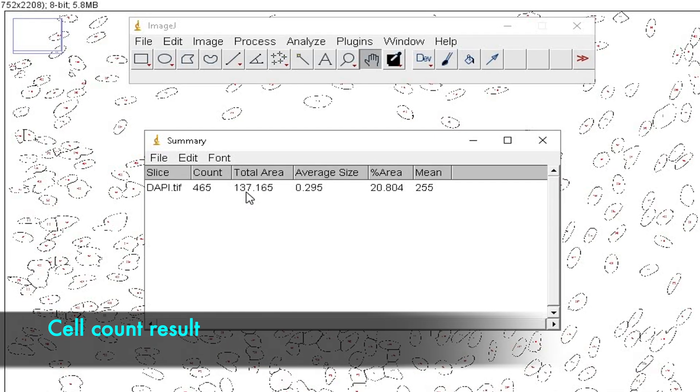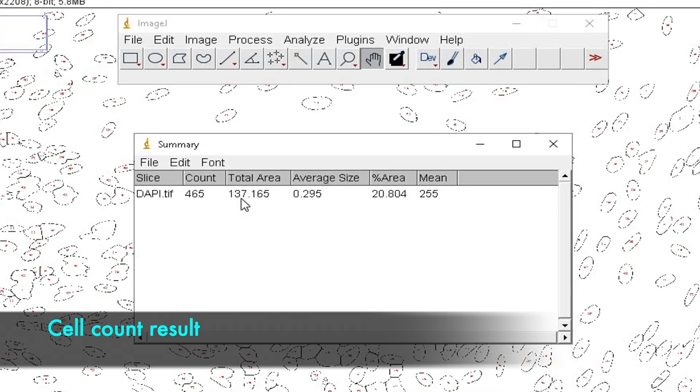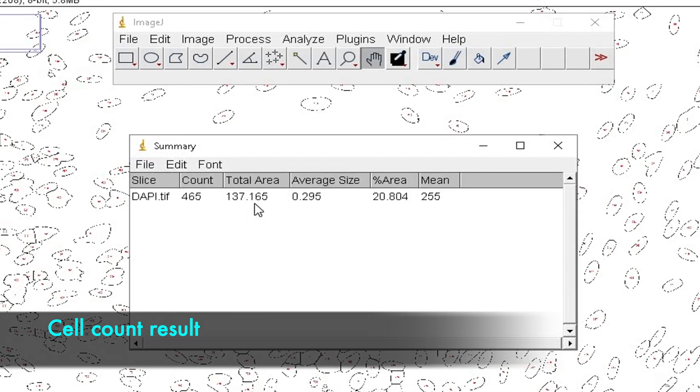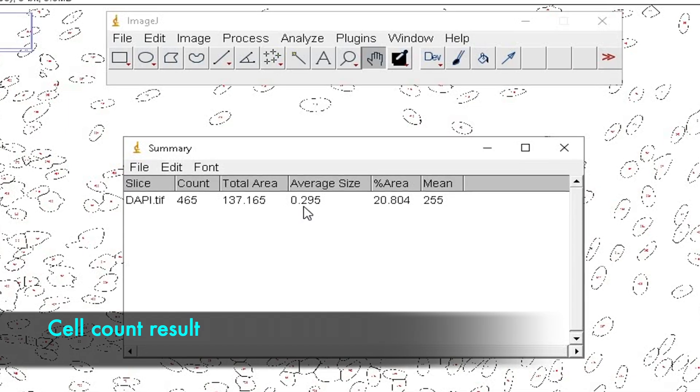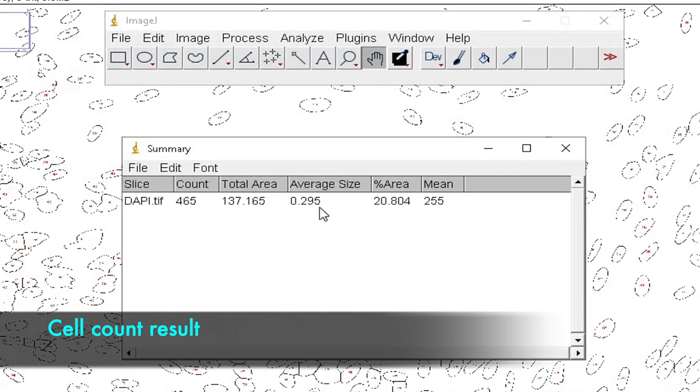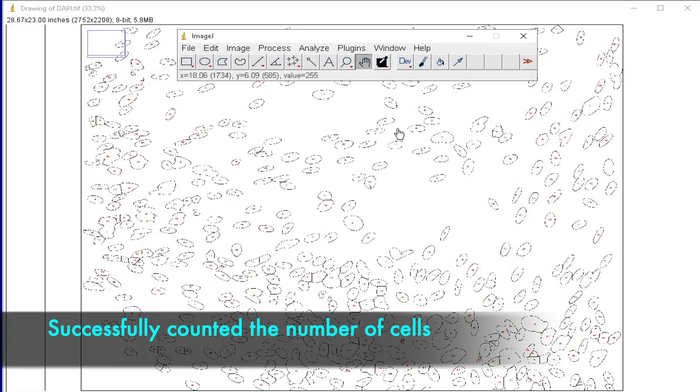Along with the cell counts, it also displays the total area, average size, percentage area, and the mean value. Thus, we are successful in counting the number of cells.